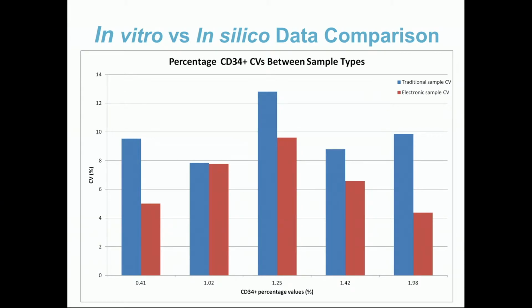And we can see from the CVs, the CVs on the wet samples are always higher. But the actual red bar, which is the CV on the electronic trial, is surprisingly high, which is saying to us that the majority of error in flow cytometry is actually analytical. On average, it's around about 60%.